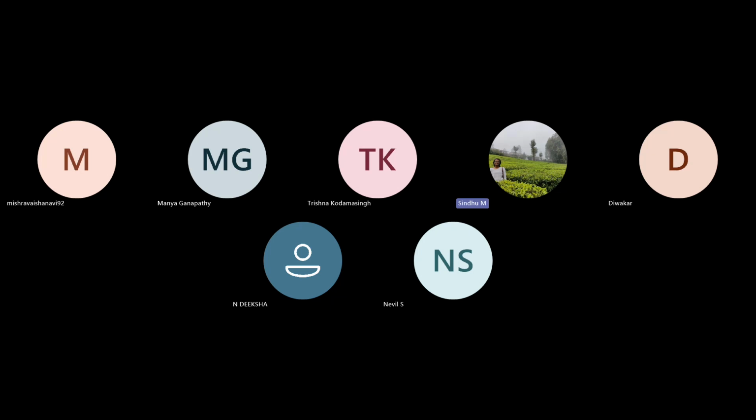Cell 3. And in this, for each ROI, the software can calculate whatever you set here. So if you go to measure, then for each of these, this is the first ROI or the first cell, second cell, it has calculated the area. And by mean, here is the mean intensity.